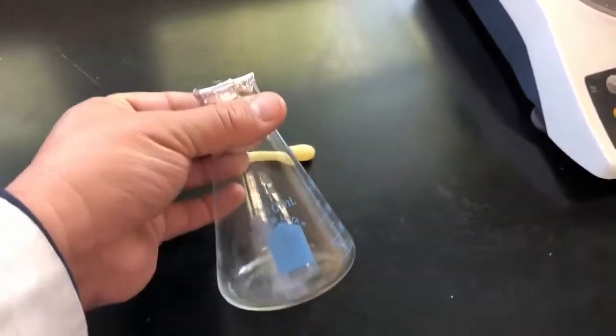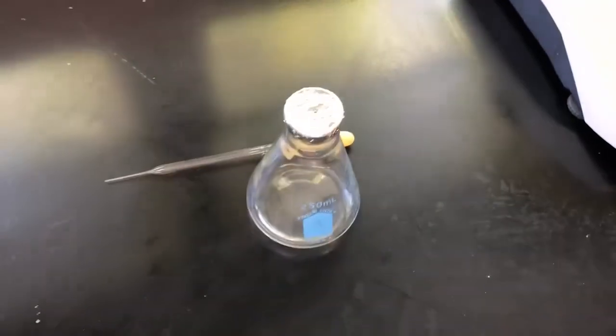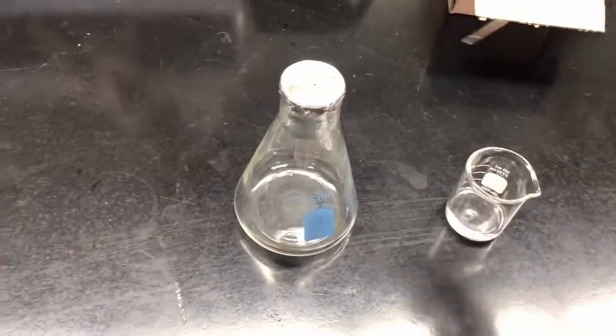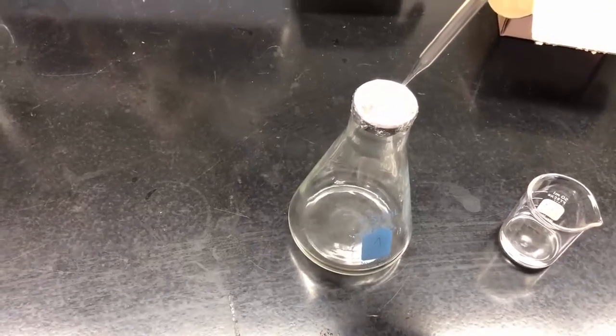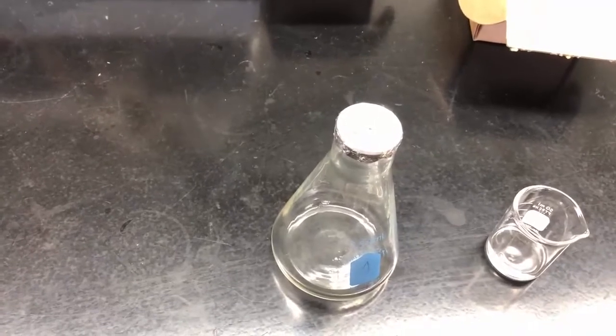Now we're ready to add the liquid and submerge the flask in boiling water, and we'll be recording those temperatures as we go along. I've pre-calibrated this pipette so I know I have about a milliliter when I pump it like this, and then I'm going to place it inside. You need five mils, so I'm going to do that five times, and then we'll run the experiment.